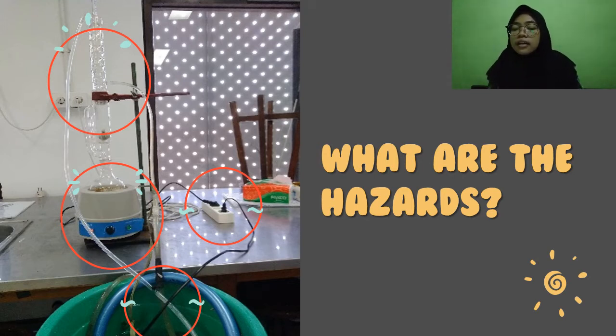Second, the heating mantle or isomantle. The heat of this isomantle can reach 450 degrees Celsius. If your skin accidentally contacts it, it will cause burns on your skin. And the third one, there are extension outlet, mini water pump, and water. If we accidentally sprinkle water on the socket, there will be an electrical short circuit which can cause fire.